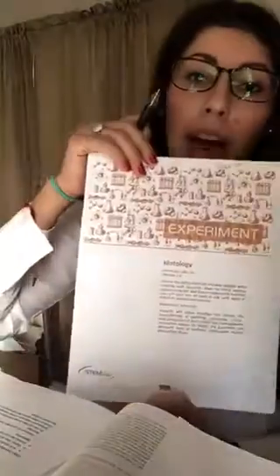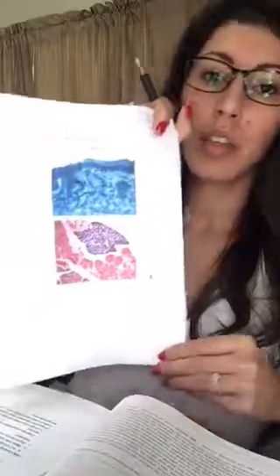So this lab is for January 21st. It's for week 2, and it's titled Histology. And here's the packet. The supply would be the histology supplement document, which is this. It consists of 3 pages.